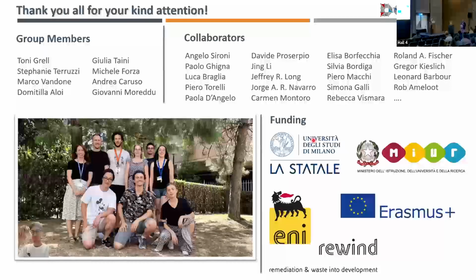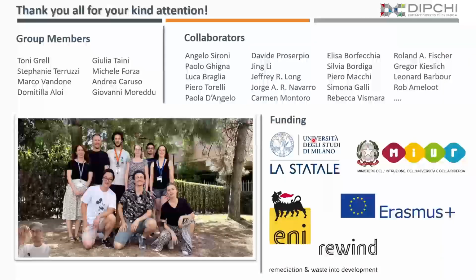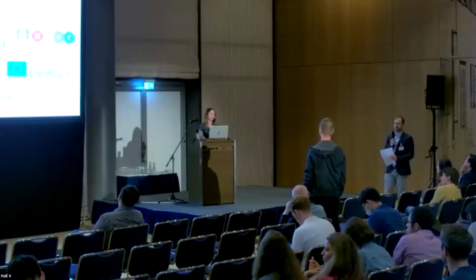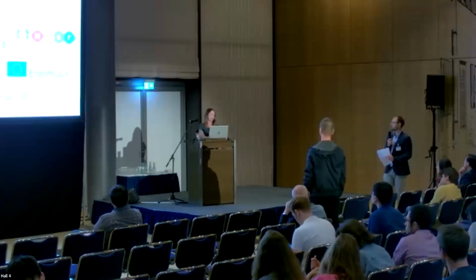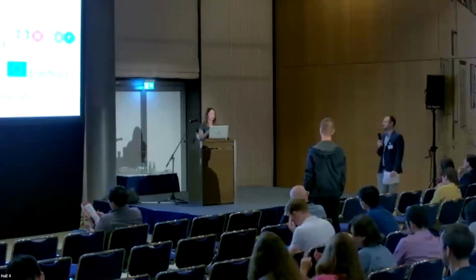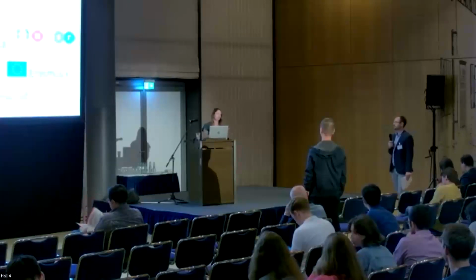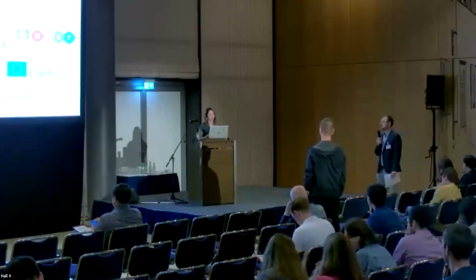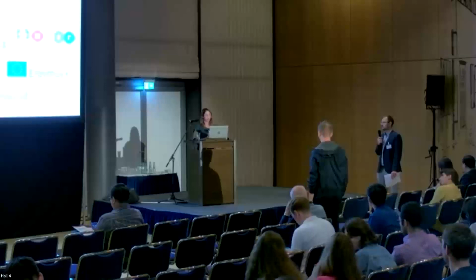So you do see the difference. Our goal now is to show how powerful this technique is. So I think for the moment we will stop on this experiment and then see if we can perform another experiment, maybe also with the hard X-rays and in combination with X-ray diffraction. It's known that through diffraction, peaks move, so the unit cell shrinks when there is the spin transition. So a combination of the experiments would be interesting. Thank you. So thank you very much.